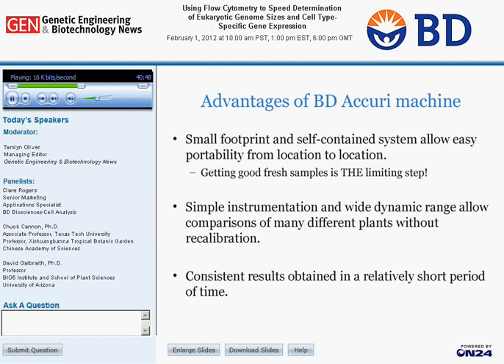And so seed banks typically go through germination trials. So they take the seeds out and they germinate a few and make sure that the seeds are still viable and they're being able to store them properly. And so when they do this, they would just throw the seedlings away. But now they can take the seedlings and get genome-size measurements for everything that they're germinating in their trials. And so it's actually a very nice thing. They can sit there and they can gather a lot of data that was just being thrown away previously.